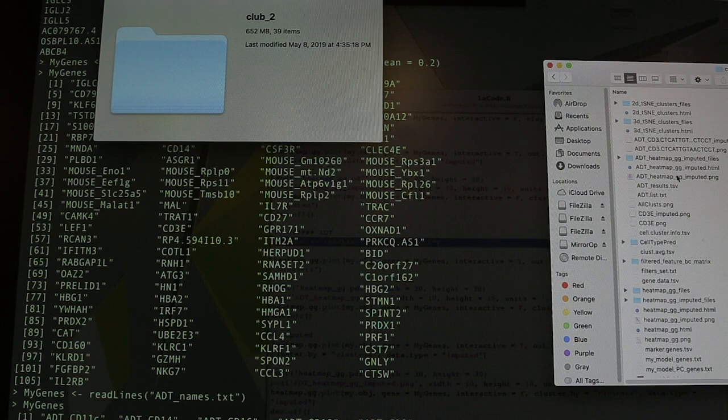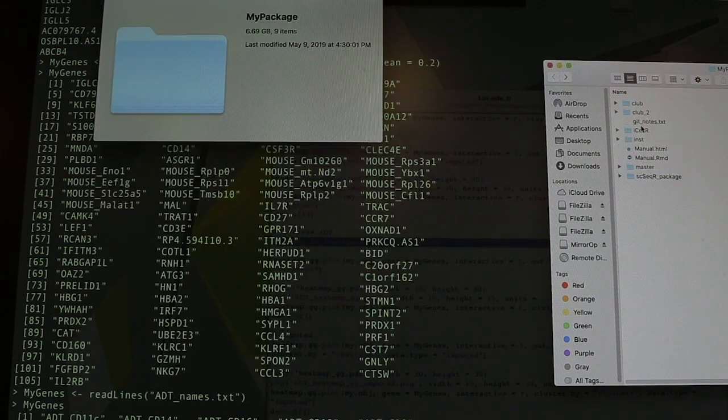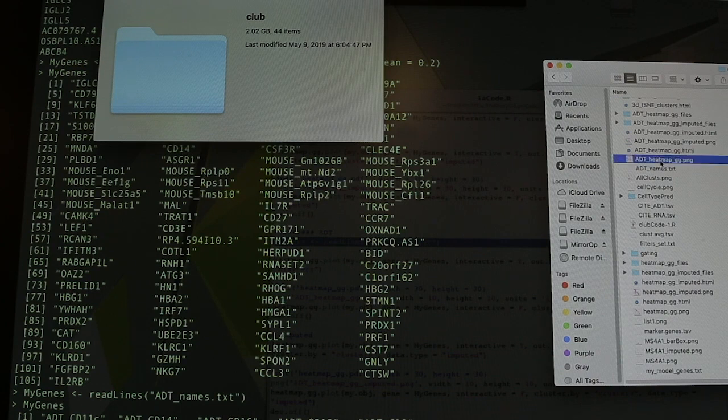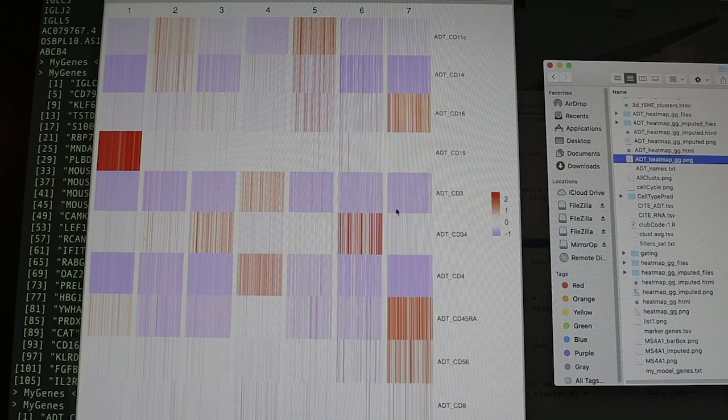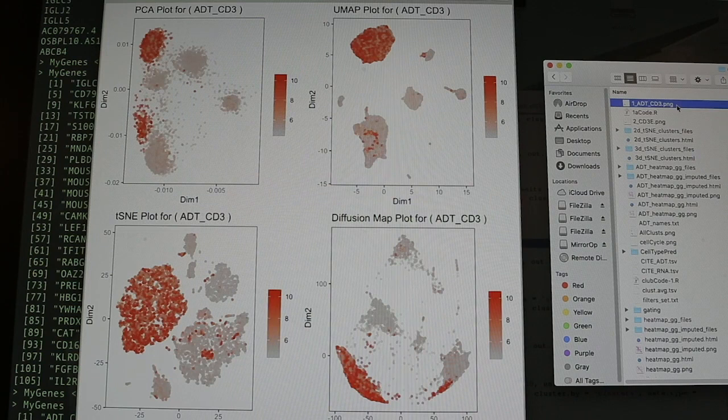When you said that some of them didn't work, what does that mean? Some of them that didn't work would be like this one. It's not specific for a particular cluster? Maybe. Actually, this last one seems to be good, for example. I've seen in my data set, there's a couple where the signal is just across the board too low, not above the background. So for that we just chalk it up to not working.